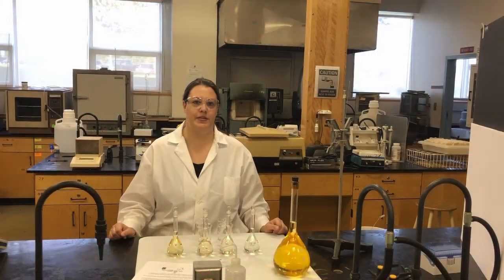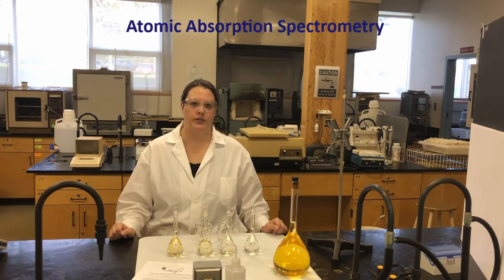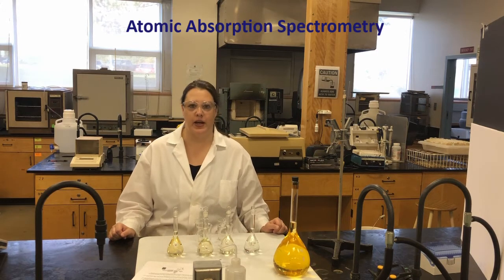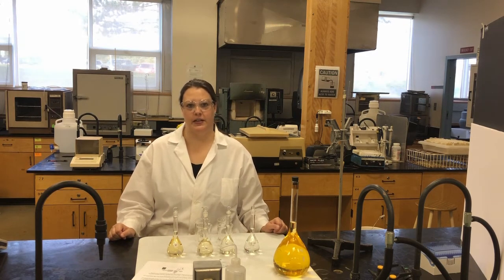So today's lab is determining trace amounts of metals using atomic absorption spectrometry. Atomic absorption spectrometry, commonly called AA or AAS, is a very sensitive method. It can detect the amounts of elements, commonly metals and metalloids, down to the parts per billion level. So it's a very sensitive technique.